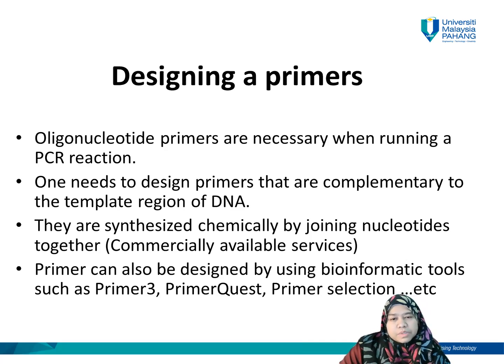The primer can also be designed by using bioinformatic tools such as Primer3, PrimerQuest, and Primer Selection. I believe we already discussed this in the GeneTech lab class, where you use some bioinformatic tools to design a primer and also the DNA analysis of the transgenic.